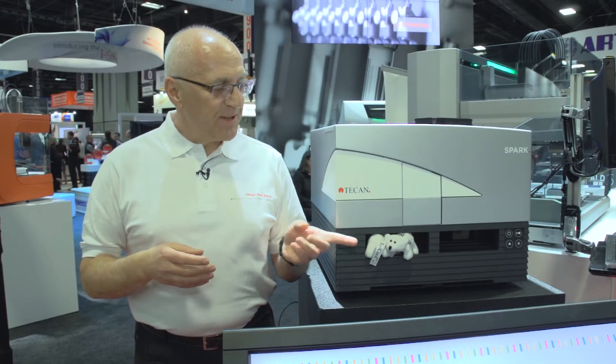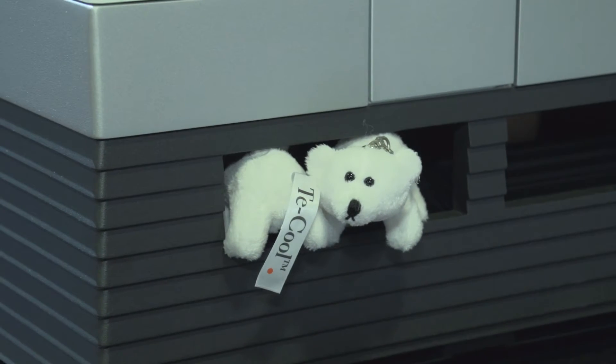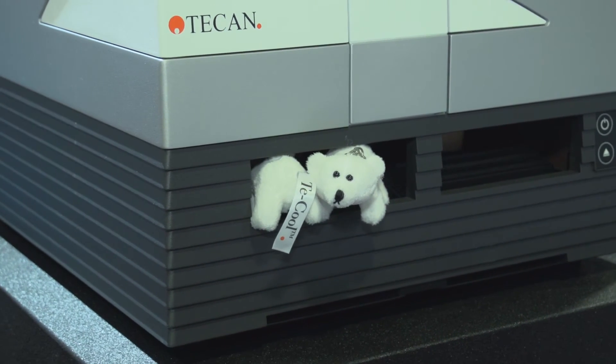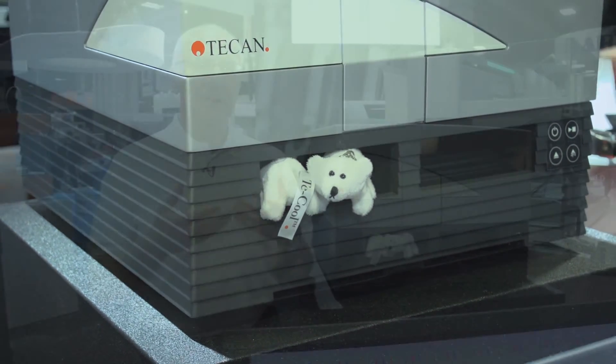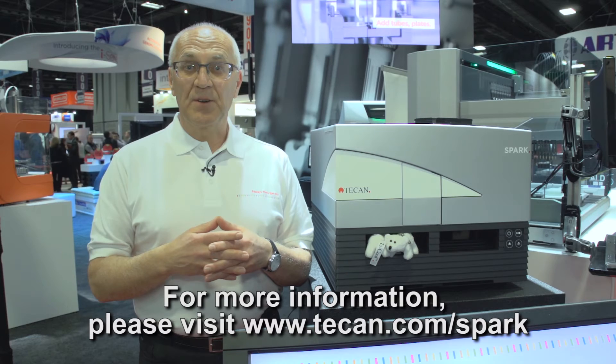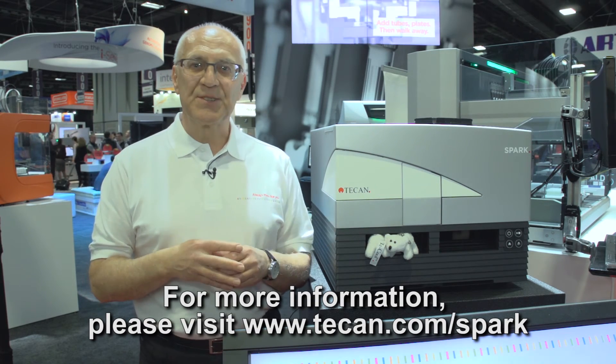As you can see, there is the polar bear with the t-cool depicted here alongside the Spark. As we know, there are temperature-sensitive assays like luminescence assays. We urge you to visit our website to check out what the polar bear and t-cool actually stand for. Thank you for letting us present the Spark at the SLS 2017.